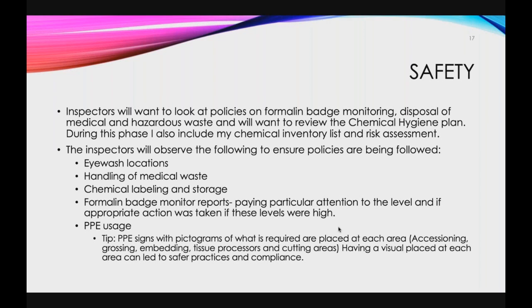The only time I had to sit separately aside from the AP inspector was if there was some issue with safety, or they had a question about the safety portion because they weren't that familiar with it, or if the general inspection of safety was all done and she was just sitting around, she would come and help out, because AP can be very tedious. They may ask multiple staff members where the safety policies are found, what to do in case of a fire, how spills are handled, and where the MSDS sheets are found. So make sure your staff is properly trained and knows where to find all of these.